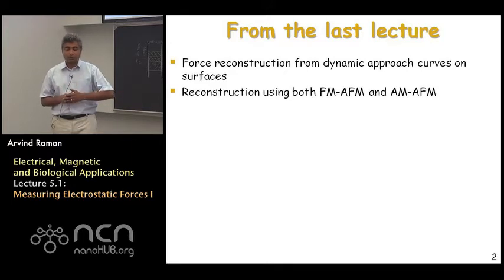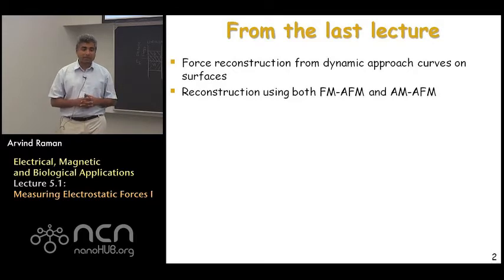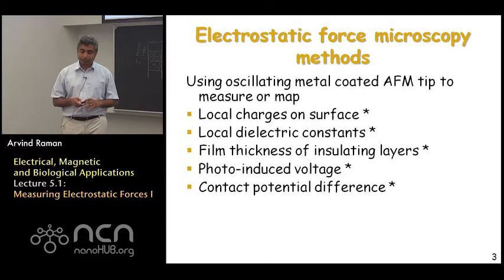What we're going to focus on during this week are extensions of dynamic AFM to measure electrostatic forces, to measure magnetic forces, and to understand what happens when dynamic AFM is actually taken into liquids, as often done to study biological samples. This is the last week of classes, and we are trying to cover more than one topic. As a result, we will not be able to go as much in detail into each one of those topics, and I hope that the references we provide and the material in the appendix is going to be sufficient for those of you who want to dig a little deeper into each of those topics.